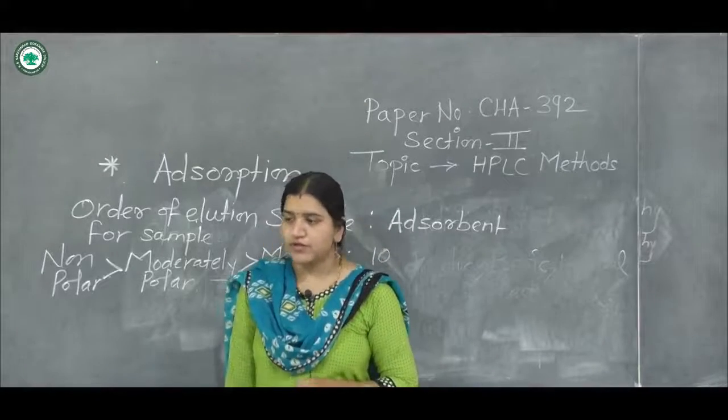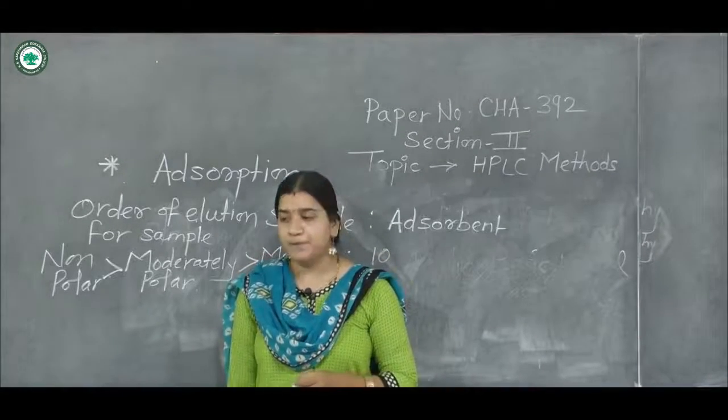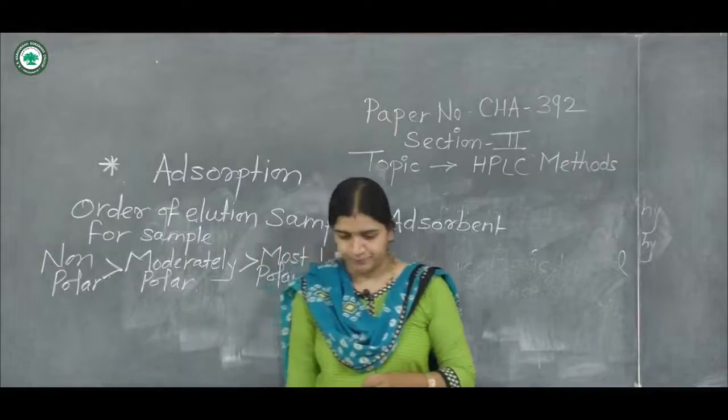So this is the order of elution for the samples in adsorption chromatography.